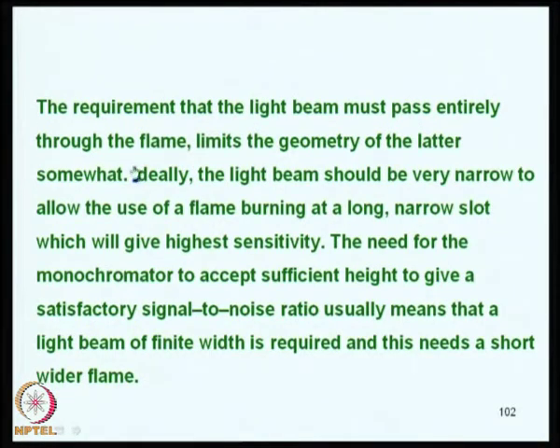The basic requirement is that the light beam must pass entirely through the flame. The light beam should be very narrow, which is another condition to allow the use of the flame burning at a long narrow slot, which will give highest sensitivity.